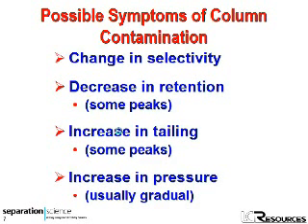The symptoms there, usually the most annoying, probably the most common, is a change in selectivity. Now, as I said earlier, if peaks move apart, we tend not to complain, but that state still may be the result of contamination of the columns. Certainly, if peaks move together, we do complain.